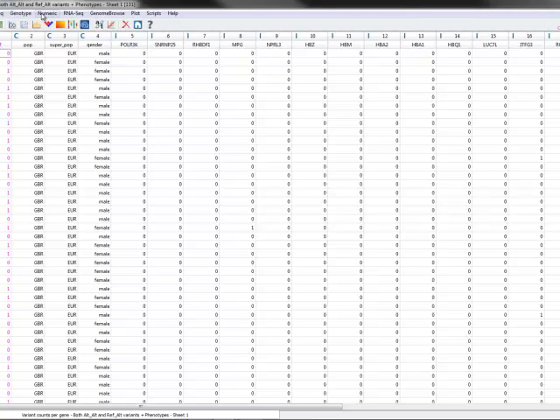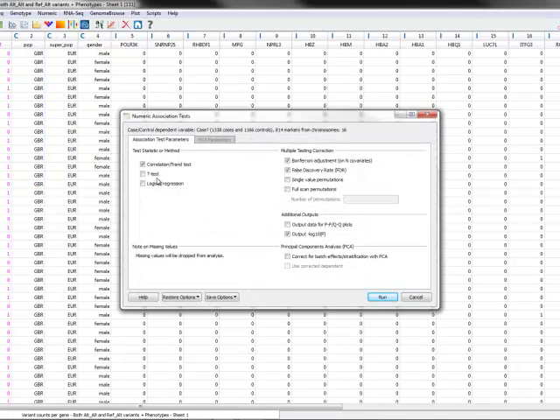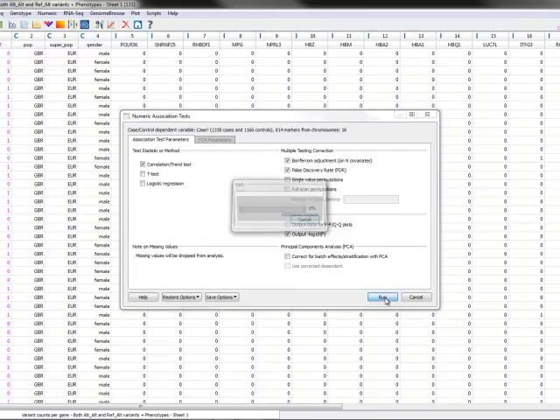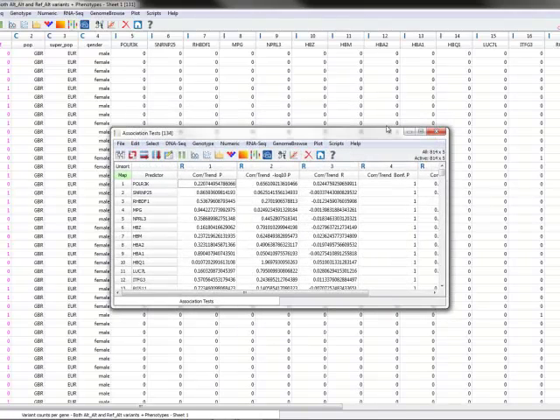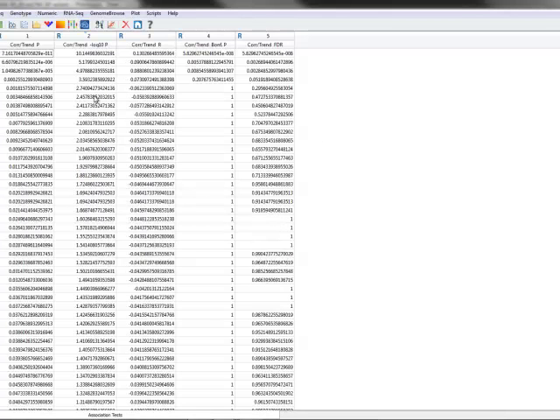And then I can select any of a number of different statistics to do an association test here. In this case, I'll just run the numeric associations, keep the standard default correlation trend test, and let this run. It takes just a moment. What I have now are gene by gene p-values, which, if sorted, I can see which genes come to the top.